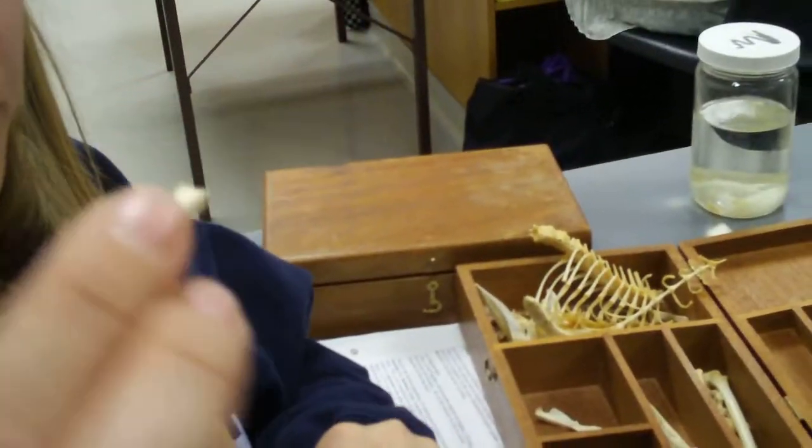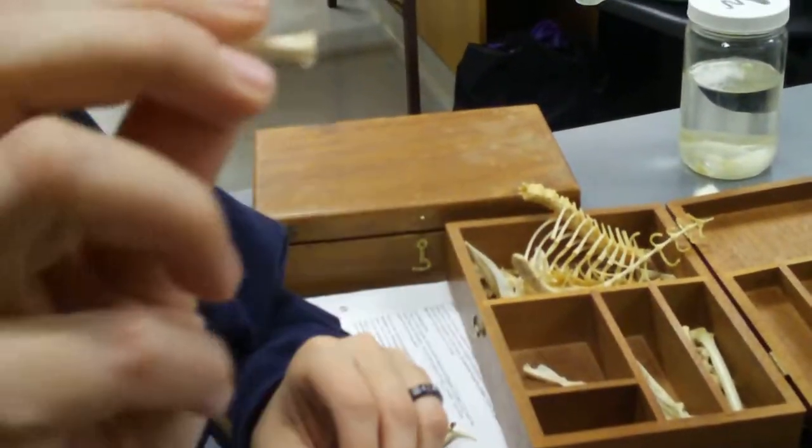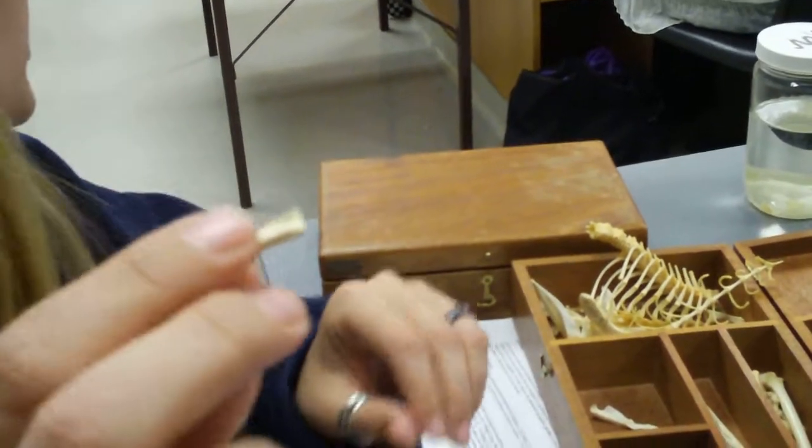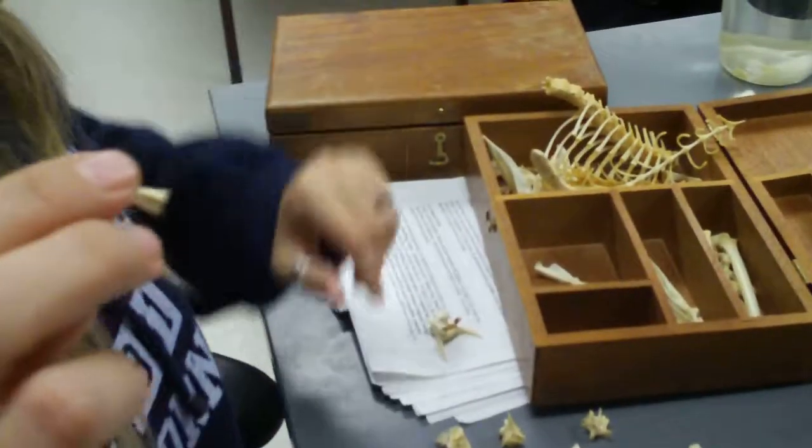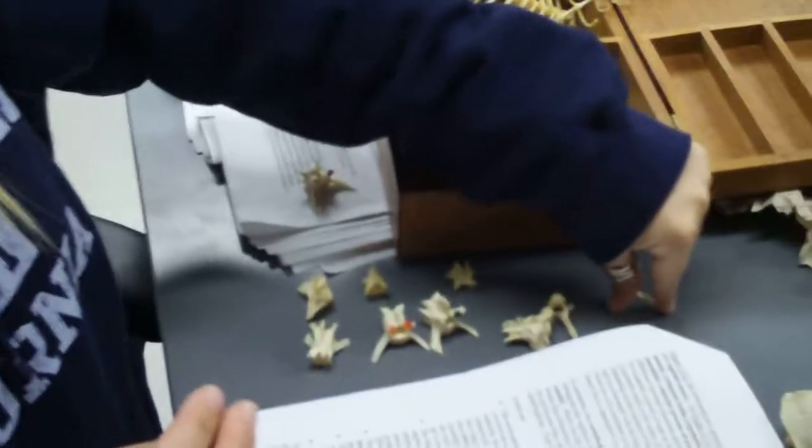This is a caudal vertebrae, so this is one of the tail vertebrae. It's really little, pretty tiny. There's a whole bunch of them. Caudal vertebrae.